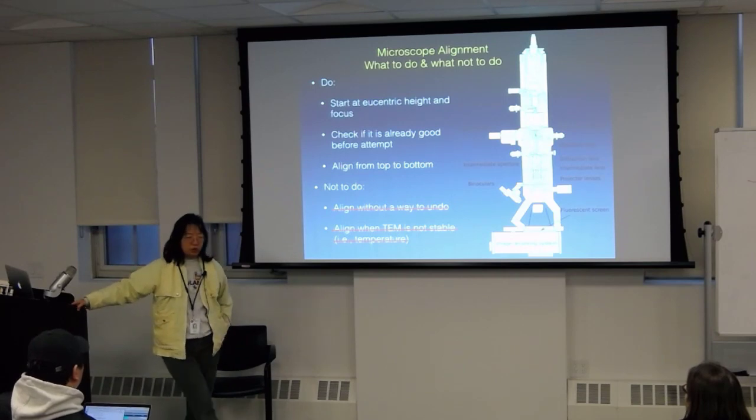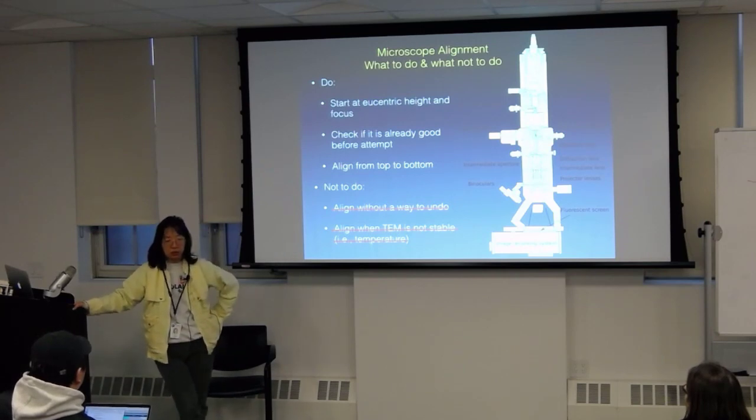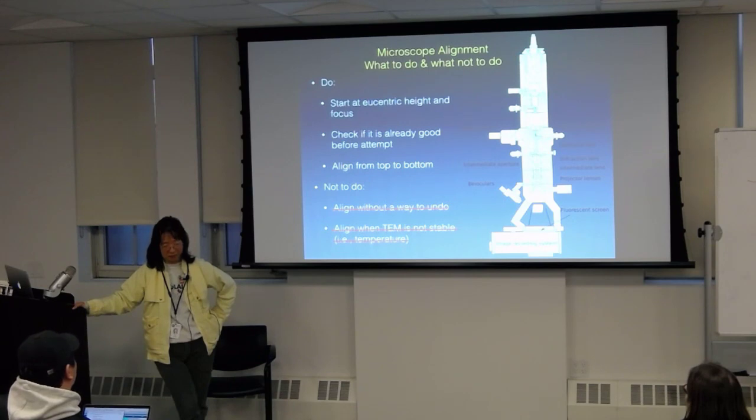On a system like that, when you say you cool it down in the morning, you actually only cool down your specimen area. Your lens is still on the whole day. So that's stable. When I say stable now, I'm referring to the lens, not your specimen. So if the water temperature to the lenses was off and the lenses were warmed up, then don't align. That's right. So that's what's important.